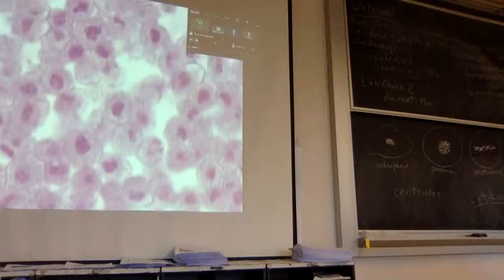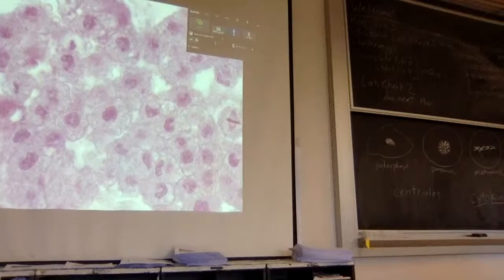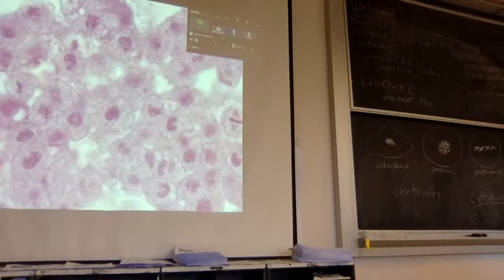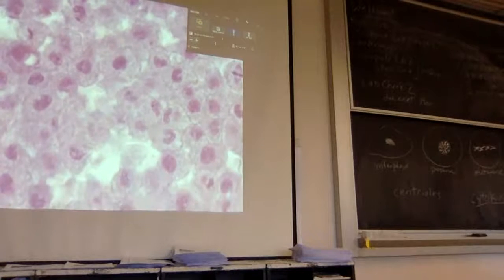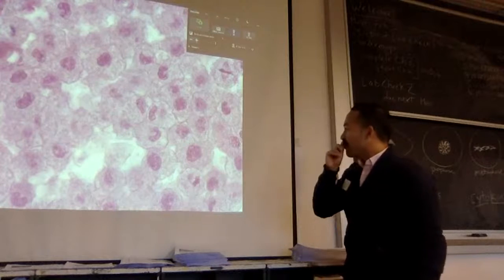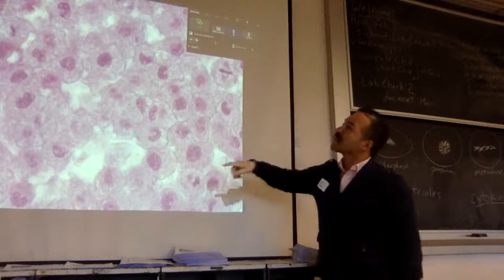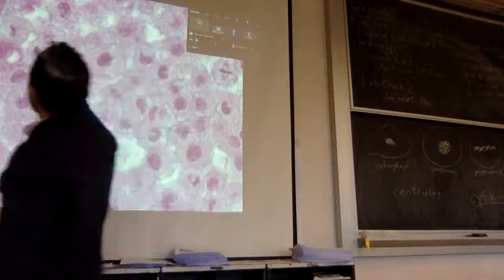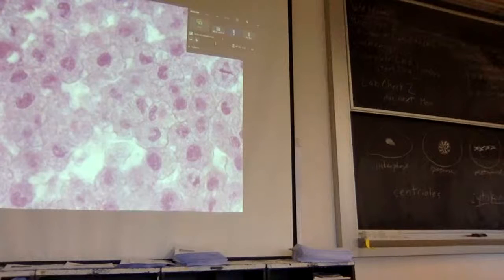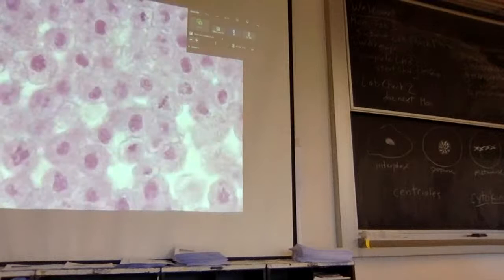See one, let me know. Oh, right there. It's metaphase. Down, down, and down. Oh, where? It was like down. Down? Middle, down, to the right. Does that one have 2 cells in it? This one? Yeah. It's a little hard to tell. It might be, but I can't say definitively. This one here? Top left. That one also looks weird. I'm not sure what's going on here. I'm going to try to find one where I can definitively say that it's an anaphase, excuse me. It's another metaphase right there.